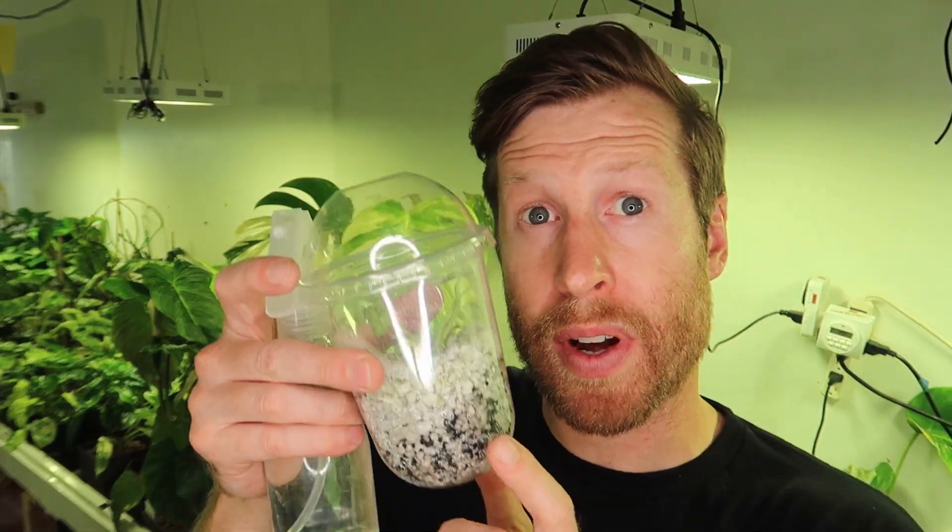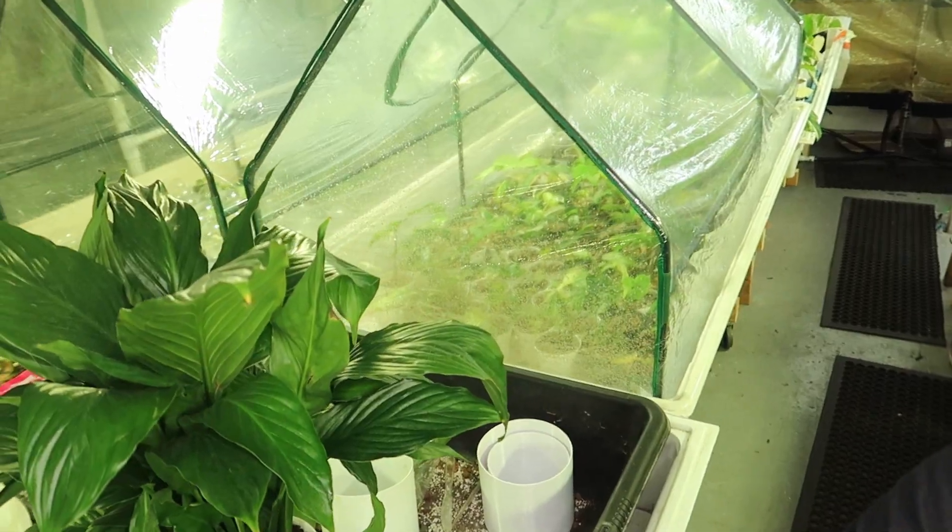I use a sterile bottle of distilled water to mist these plants — I'll open up the tops and give them a mist to make sure the humidity remains high. Once I see those roots, I'll start to slowly acclimate the plant to my greenhouse space. First, they'll enter the greenhouse tent without lids on for the next few weeks, which is around 80% humidity.